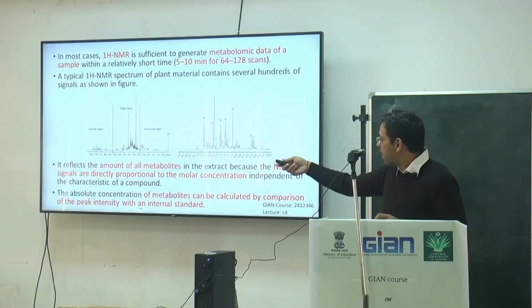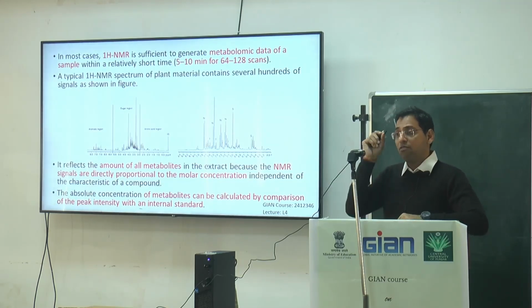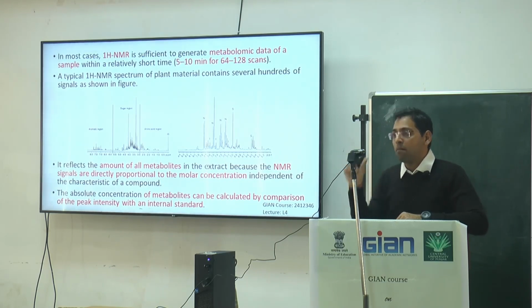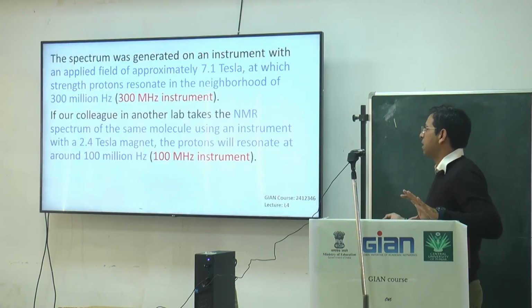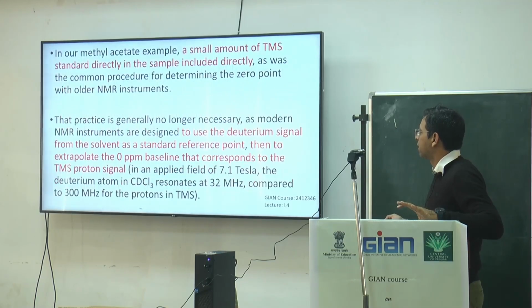So this parameter, ppm, is the most important for all of us. Whatever pattern you get will be between 2 and 8 ppm. So the 2 to 8 ppm window is the area where you will capture the maximum resonance in a particular NMR. This is the point that I would like to explain here, and I know you now know a little bit about NMR. Okay.